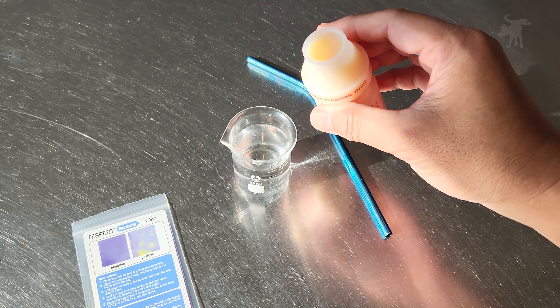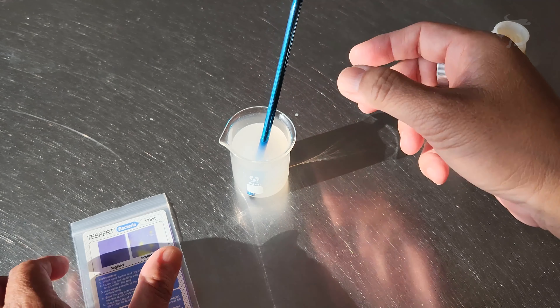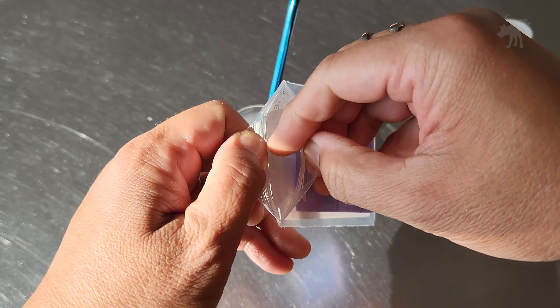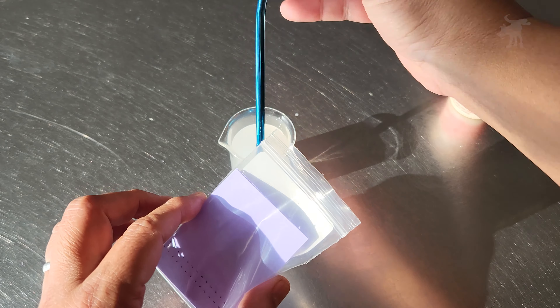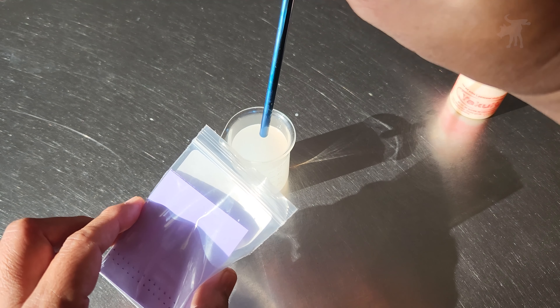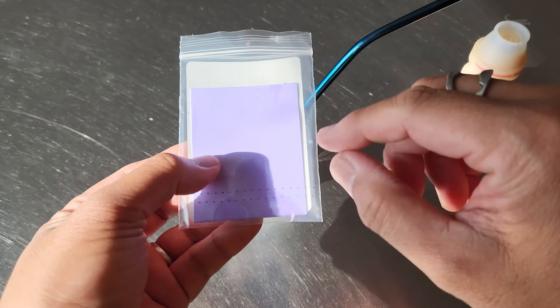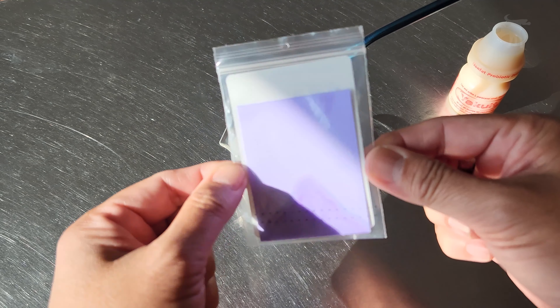Be pouring a couple of drops — it's quite a bit more than I was intending, but that should be fine. I'll just mix it in there. Now let's open up this sample pouch — and be careful not to touch the interior of the strip. We're going to be putting the sample in there, taking a little bit of water sample to make sure there is sufficient liquid in there. I'm going to close this up and then place it at room temperature away from the sun and come back in 48 hours to see if there's any changes.